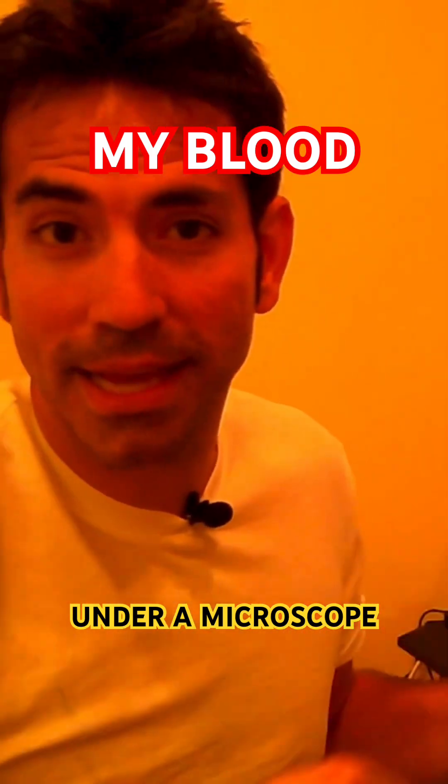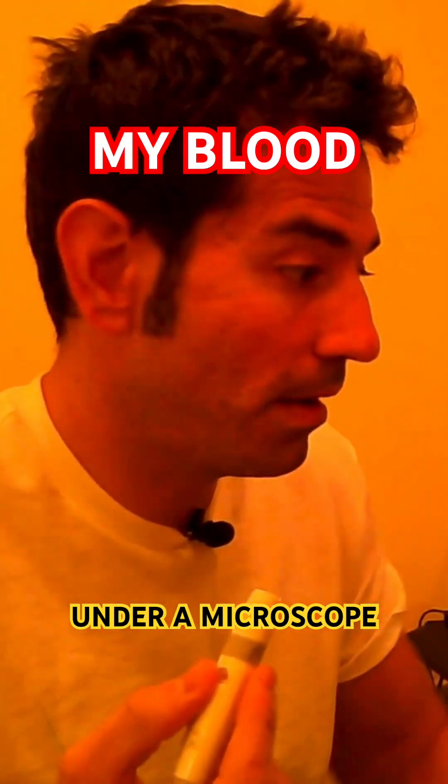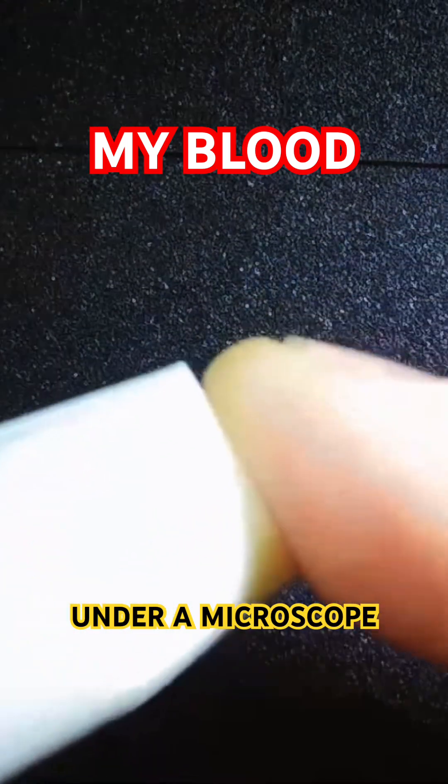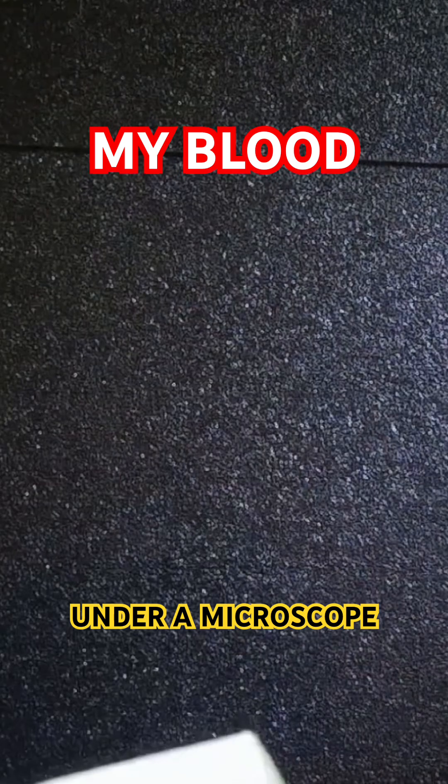So we'll see what's up. Sometimes you just gotta man up when it comes to this kind of stuff, so I'll show you here. Let's stick my finger really in there. It is working! Yes!